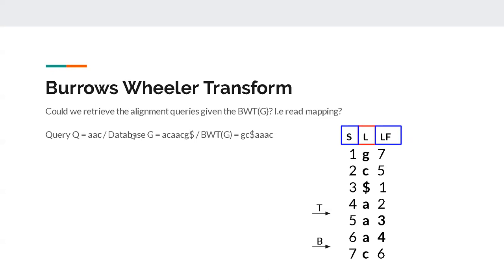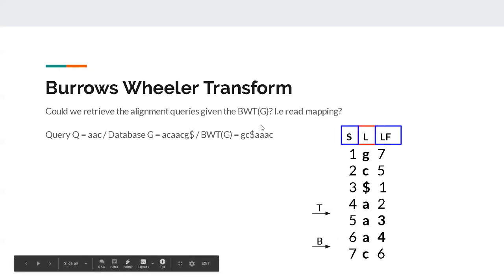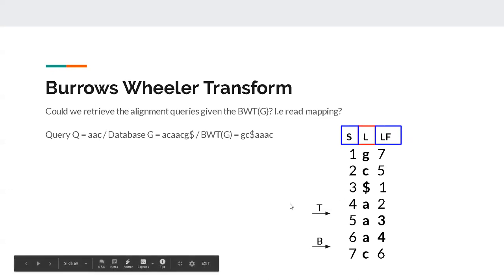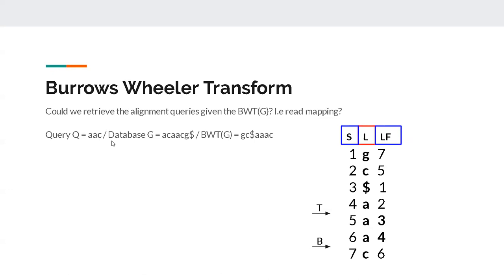And if you notice, I have put this thing in bold over here. So you have located C already, and you have moved to the next rows. Now it dictates you to go to the 3rd and the 4th row. And also there are A's over here. So definitely you also have an A in your genome, which is a part of the read. You move to the 3rd and the 4th row.